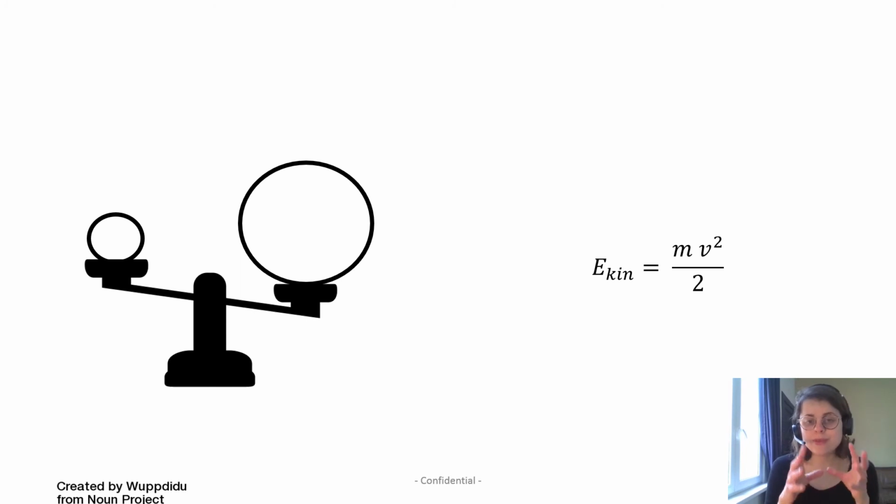So if we then look to the bead size, of course, the biggest beads weigh more. And if we then look to the equation of kinetic energy, we see that an increase in mass means that there is also an increase in kinetic energy, meaning that this biggest bead will generate more energy to your system and of course will increase the particle size reduction.